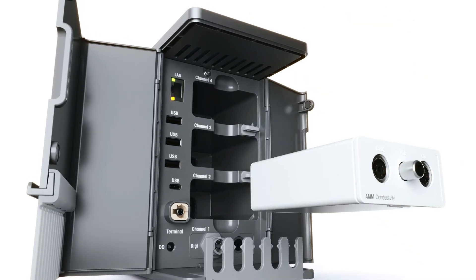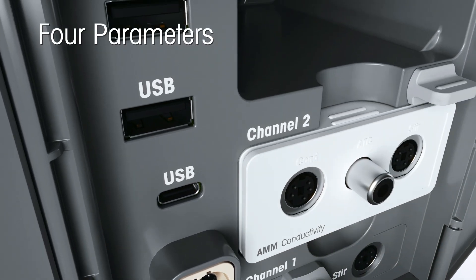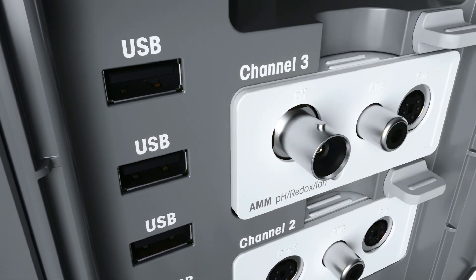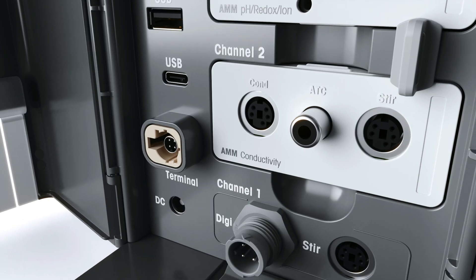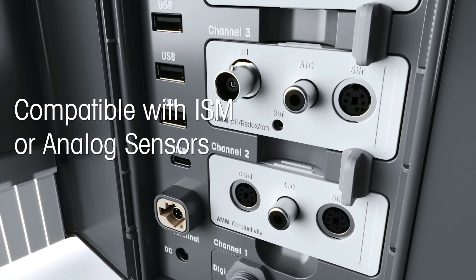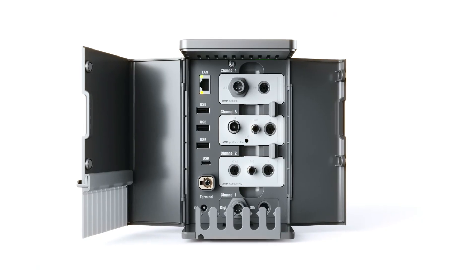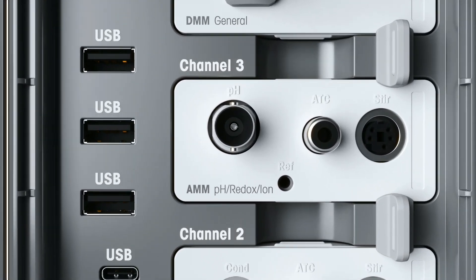To expand the meter's productivity, simply add more modules to measure up to four parameters, either simultaneously or in a custom sequence, depending on your workflow. And what's more, by adding an analog module, 9Focus is fully compatible with your ISM or analog sensors. That flexibility means you're not locked into a single-use device. Your investment is protected for the years to come.